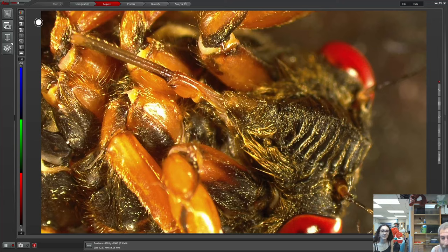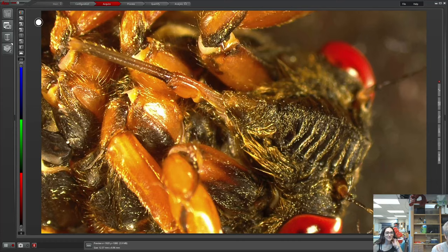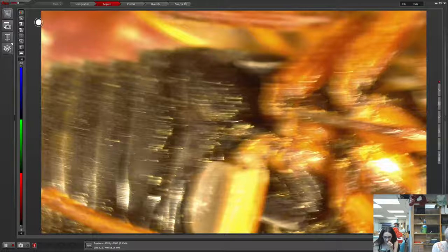I don't know the differences between them, but there's probably only one that's the black body, orange legs, red eyes. It says it is three species. One of them is black with red eyes and yellow legs. There should be three different species in Brood X, and we've got them in the stereoscope.